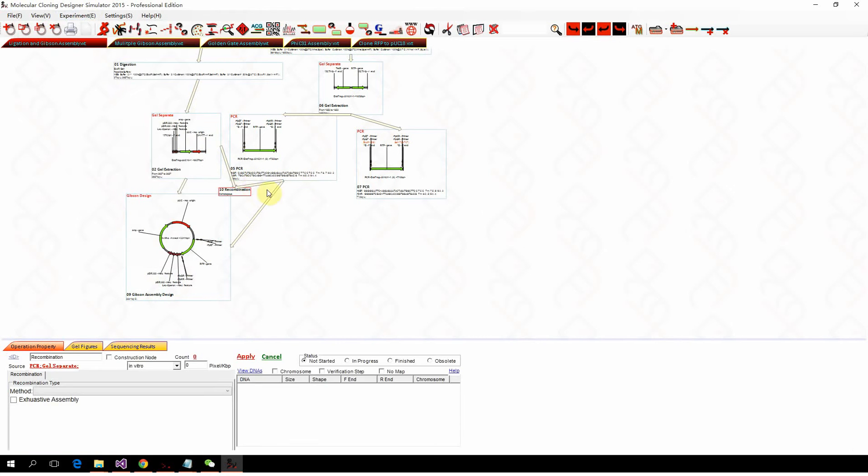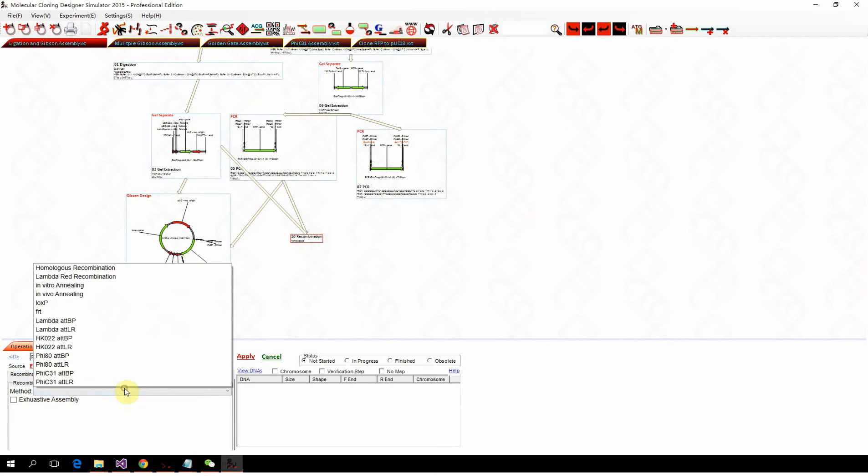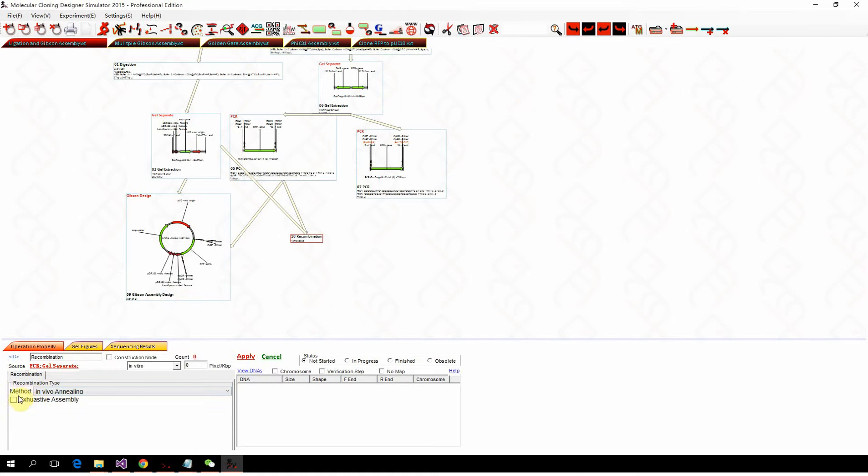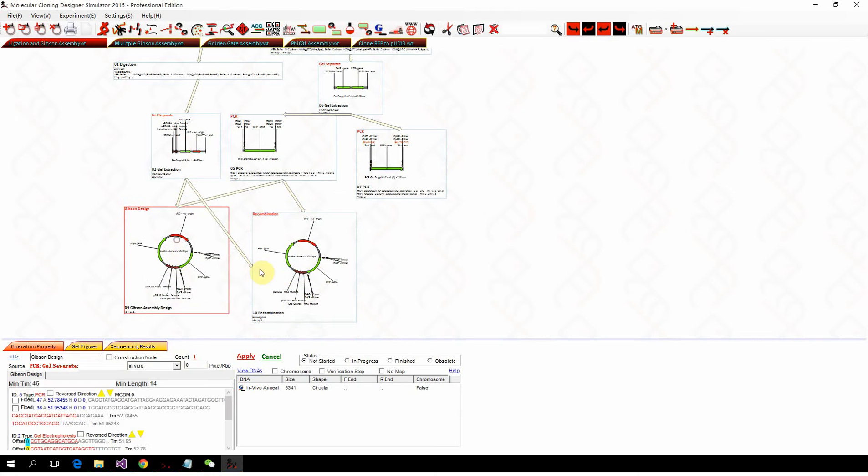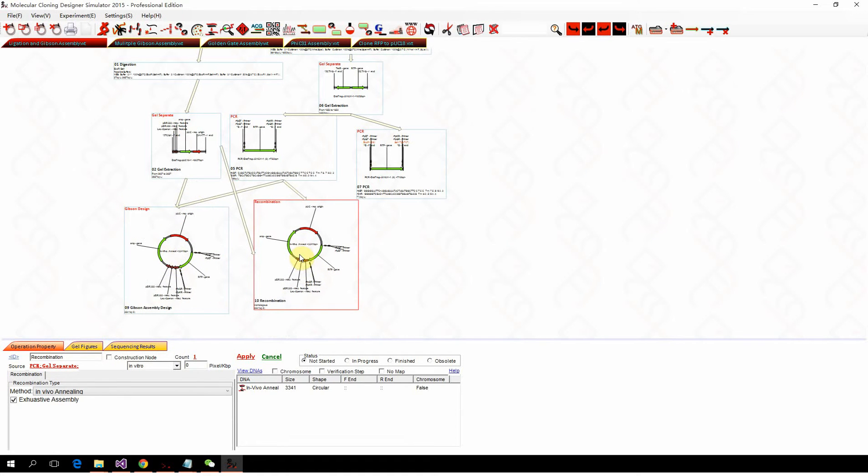The recombination option in vivo annealing, if you click the exhaustive assembling mode, is identical to Gibson assembly.